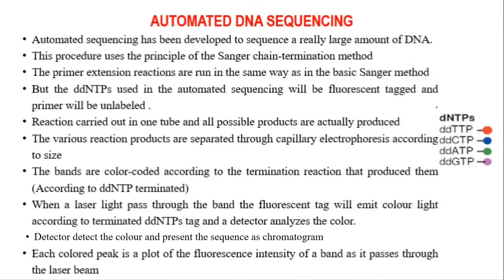Now we can automate DNA sequencing. Automated DNA sequencing has been developed to sequence a really large amount of DNA.